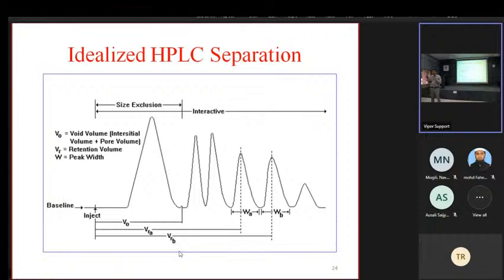Maybe it is the calibration of adsorption chromatography HPLC. I'm telling you adsorption chromatography equipment because about 90% of HPLCs use C18 columns, the reverse-phase HPLC columns. So that is generally the largest percentage. That is how you have encountered the carryover effect, and that is what I'm expecting.